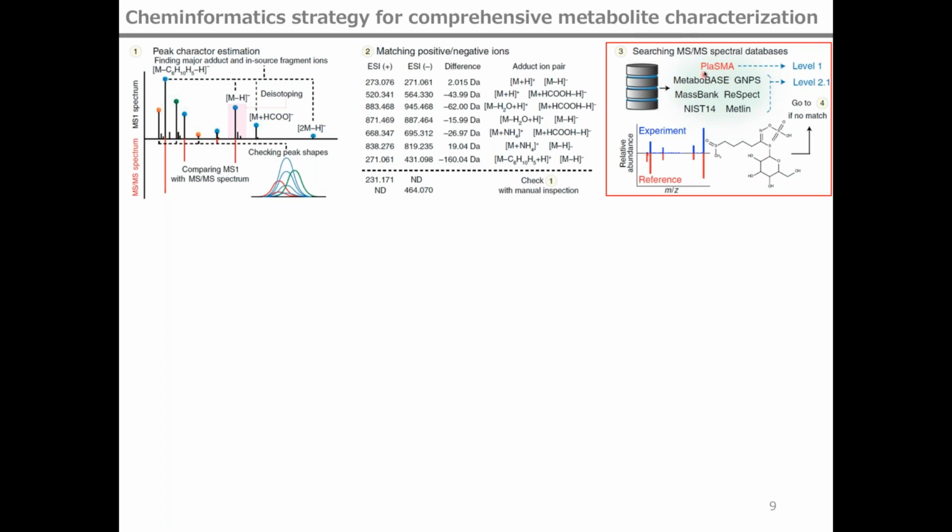We call it the PlaSMA database, and we integrated the publicly and commercially available spectral libraries as much as possible to annotate metabolites at level 2 annotation.